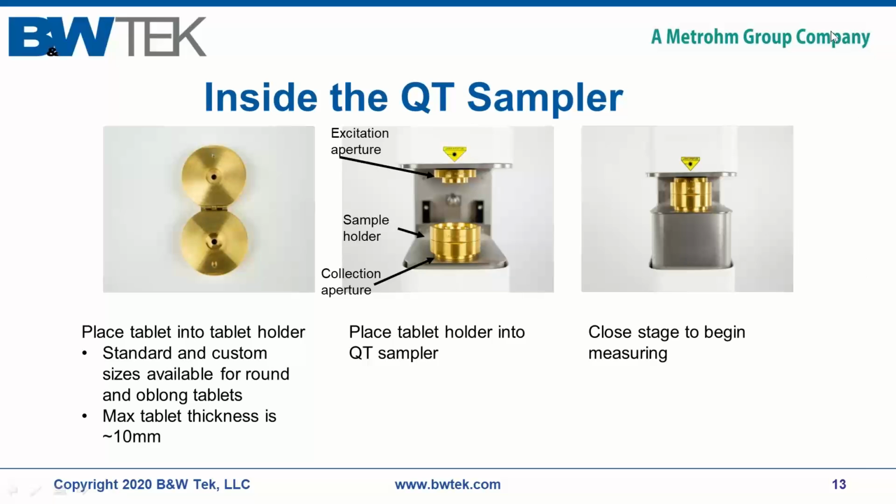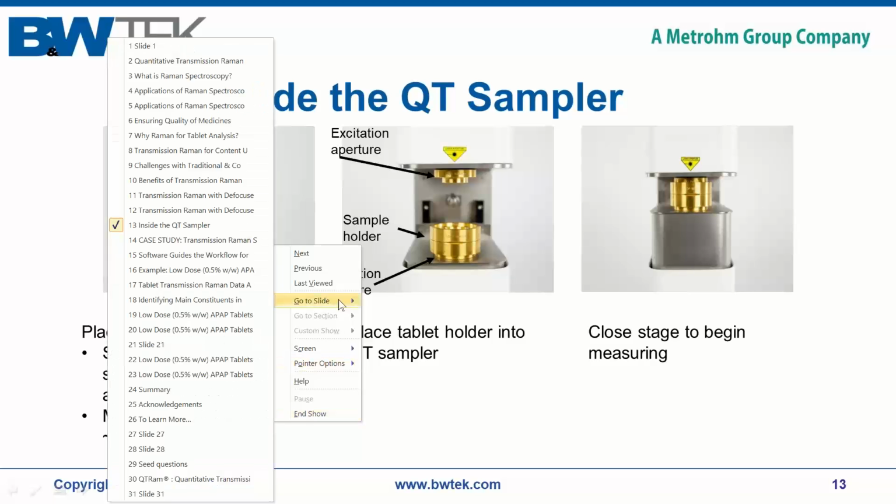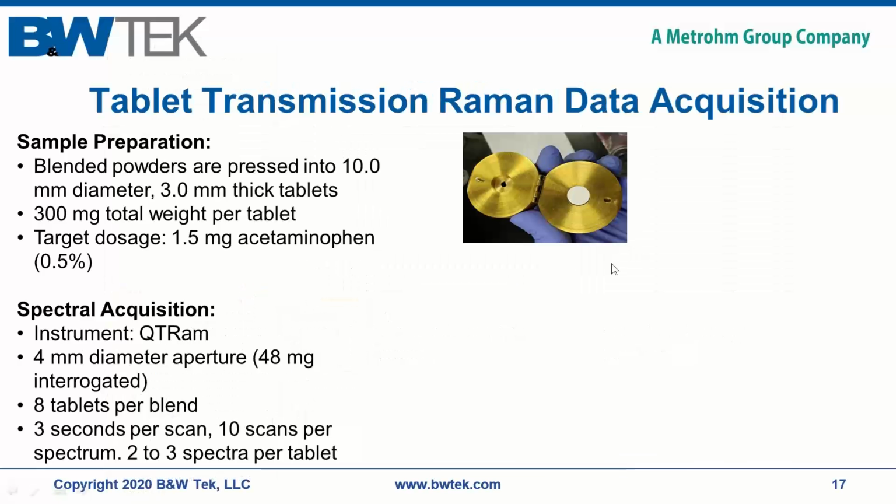So I'm going to ask this question. You might need to just correct me a little bit. Why constituent with high fluorescence doesn't mask the spectra of the product? So if you do have high fluorescence, it will mask the signal. But in this case, if I show you the picture of our spectra here, we do have some fluorescence, but it's not too much to actually be a problem for us.